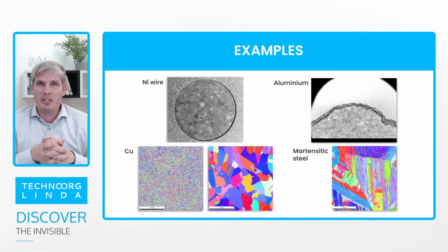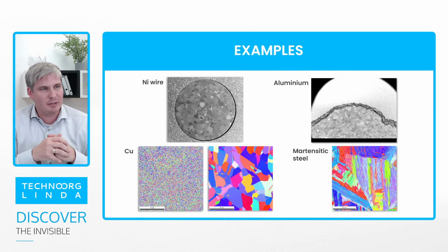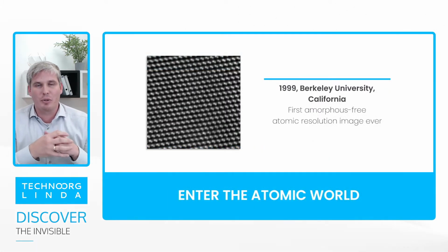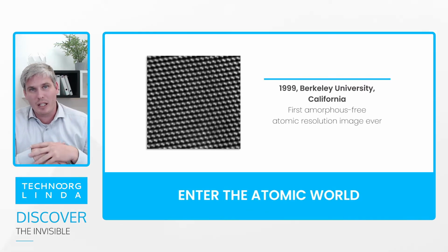So it's a commonly used technology, but the most delicate and sensitive part of the sample preparation is definitely when you want to see the artifact and damage-free atomic structure. Actually, what you see on the screen right now.